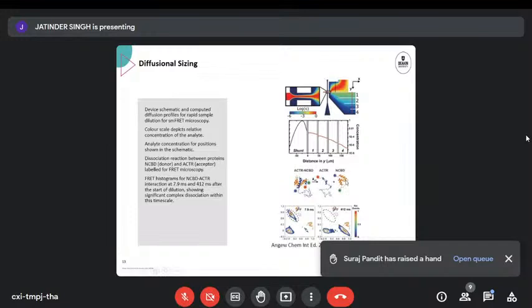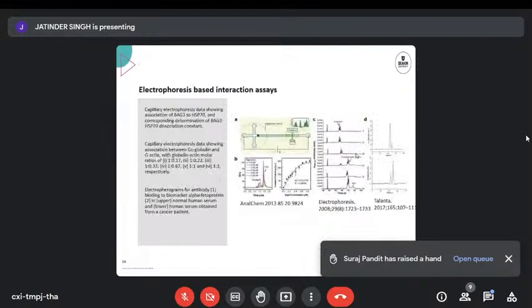This here is the computational fluid dynamics simulation. This is what they hope will happen. This is the distance in Y where the concentration drops from the high concentration here in the shunt in the narrow pit to bins 1, 2, 3, and 4. Maybe they've got just a microscope and they do direct imaging. I don't know if that's fast enough. But most of the spectroscopy experiments I've seen have been offline. So they do the separation, then once their fractions are collected, they freeze the separation. And they then have the time to do the spectroscopy over much longer duration.